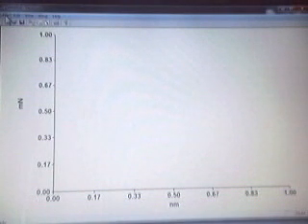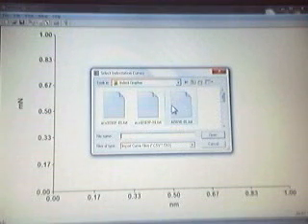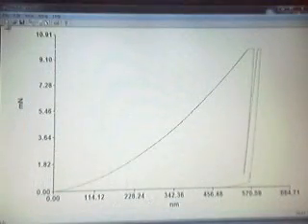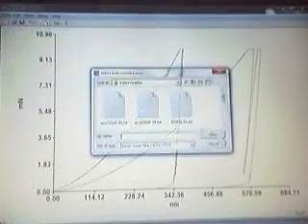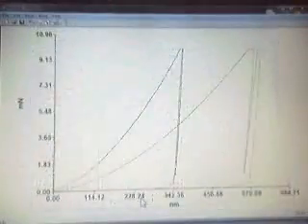To begin, we're going to do the analysis of three materials: steel, aluminum, and fused quartz. Import the data into the indent grapher. You can click on the files. There's the aluminum. There's the steel. And then there's the fused silica.